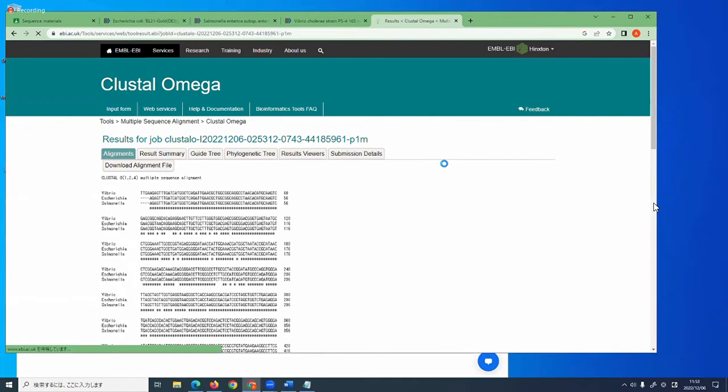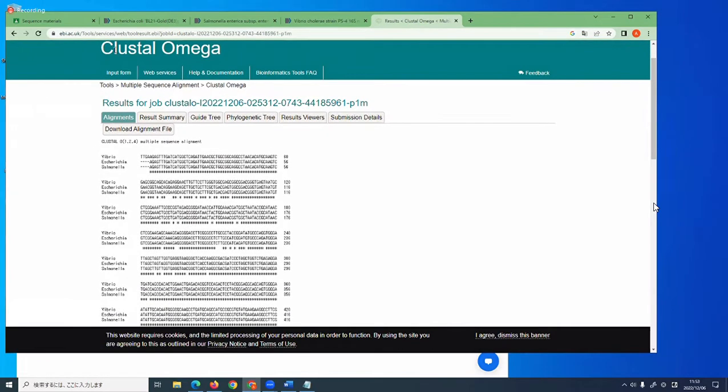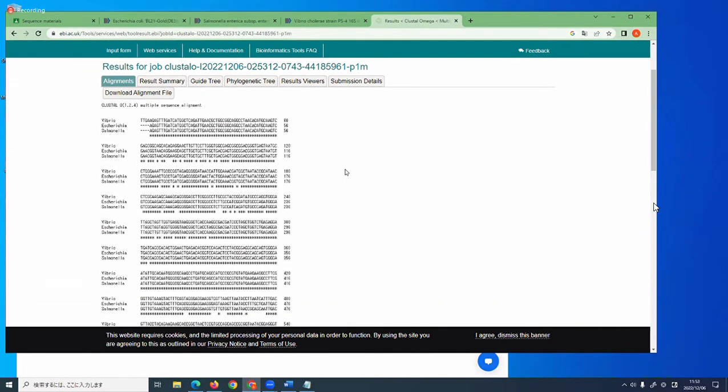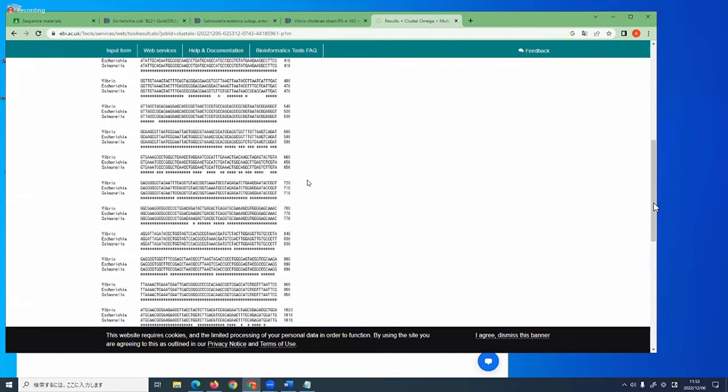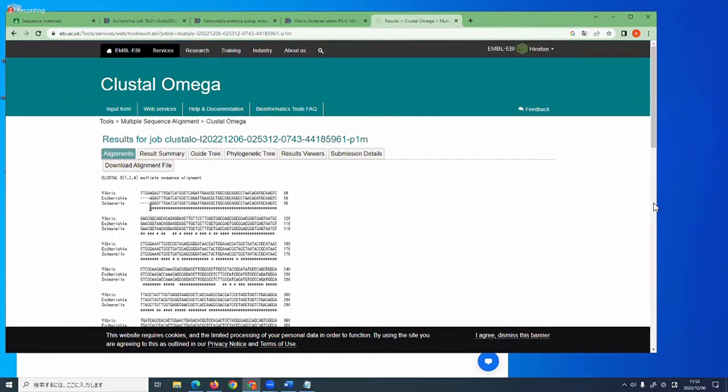All right. So for a typical alignment project, this is a Clustal tool. Previously, people used Clustal W, but there's an updated version, because it's of course online software again. You can also use Muscle and other software. So we have multiple alignments here. If you see an asterisk, that shows there's a similarity between the 3 sequences that we put in. And you see there's also spacings, right?